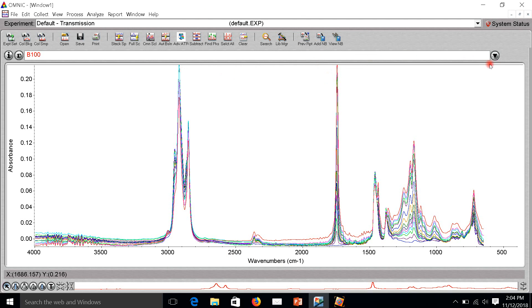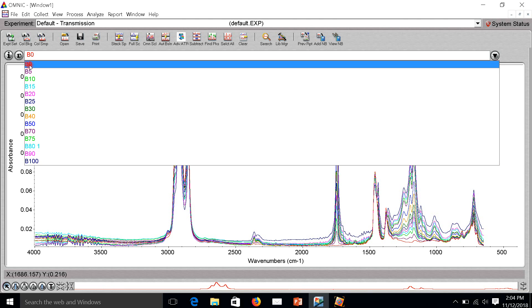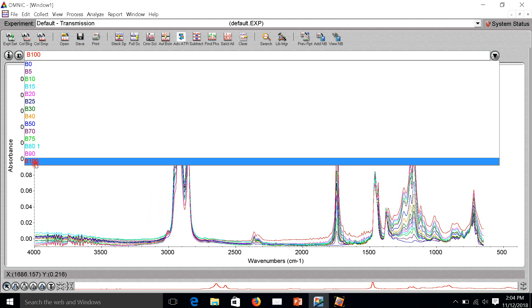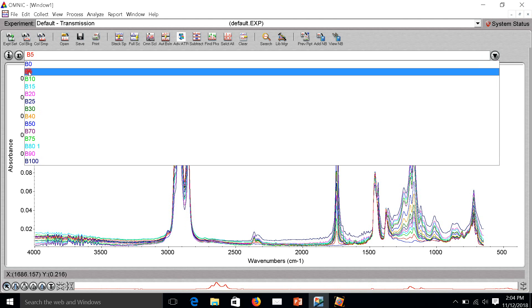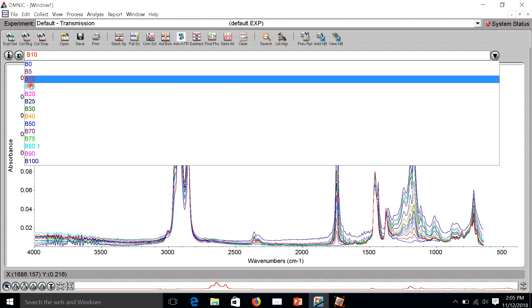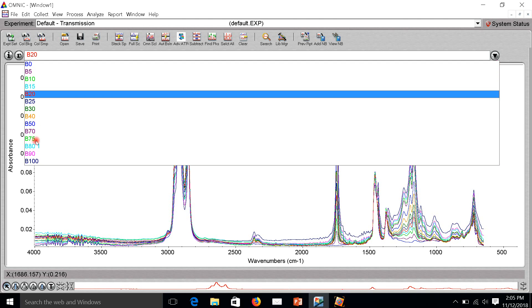I scanned from B0, which means pure diesel fuel, and this one is pure biodiesel. This one is B5, it means 5% of biodiesel in diesel fuel. This one is B10, B15, B20, and so on.